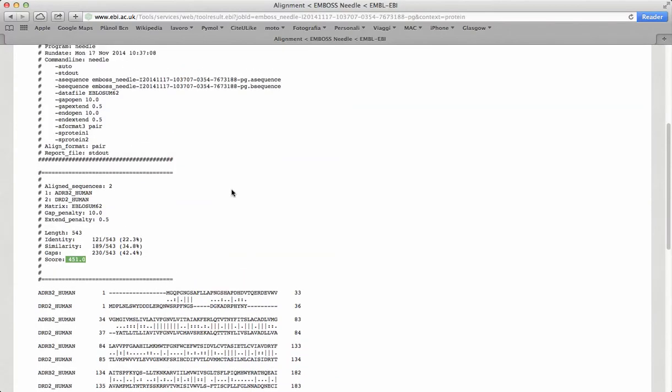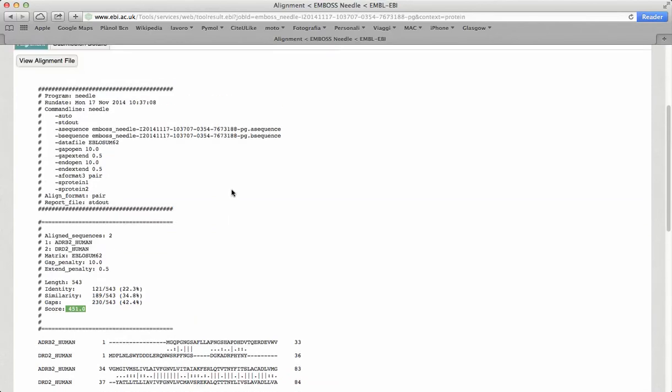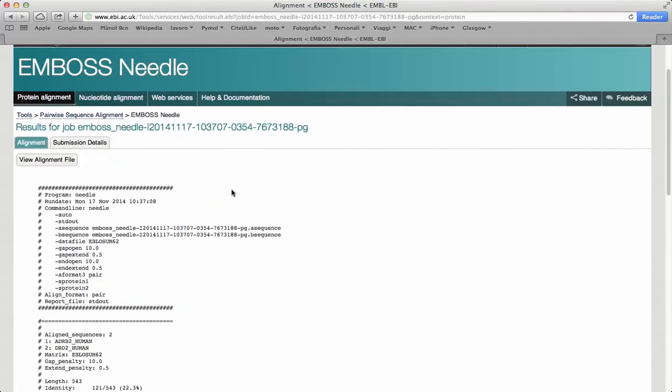With this simple example of an alignment calculation between different sequences, we can make assumptions of the relationship between these three sequences.